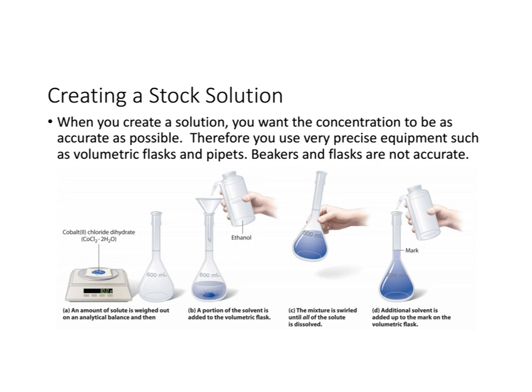A stock solution is merely a solution that we make by ourselves, and we know the concentration of solute in a very precise and very accurate manner. And to do this, we need to use very precise glassware. And the most precise glassware we can use in chemistry are volumetric flasks and pipettes.